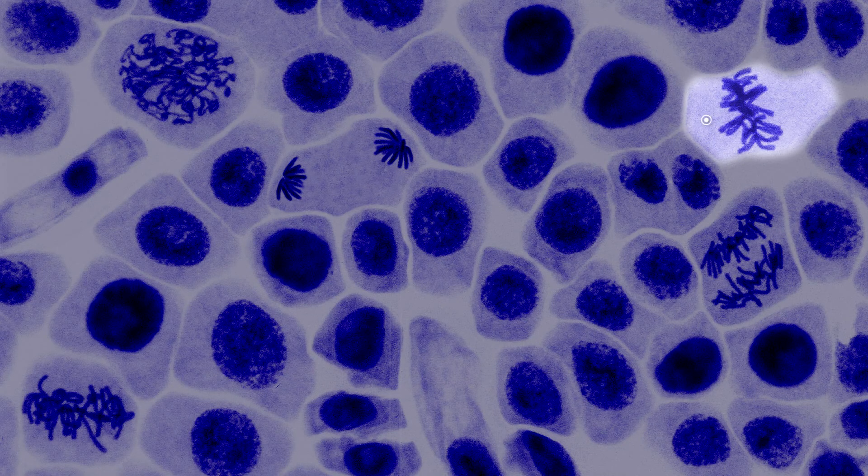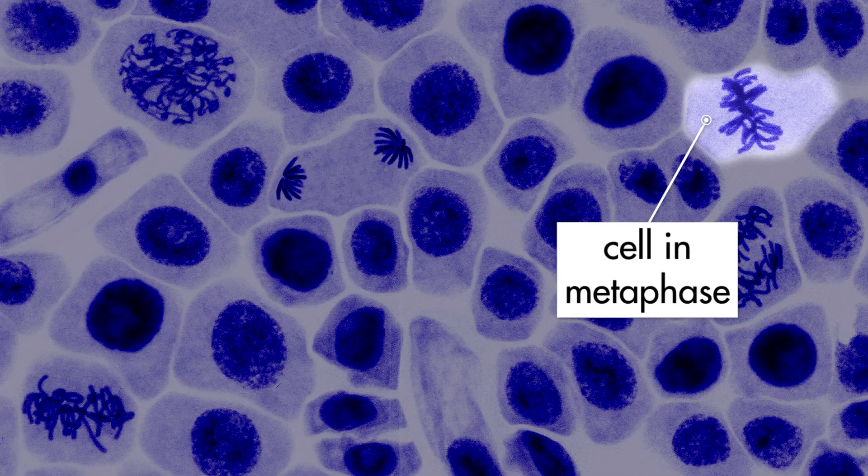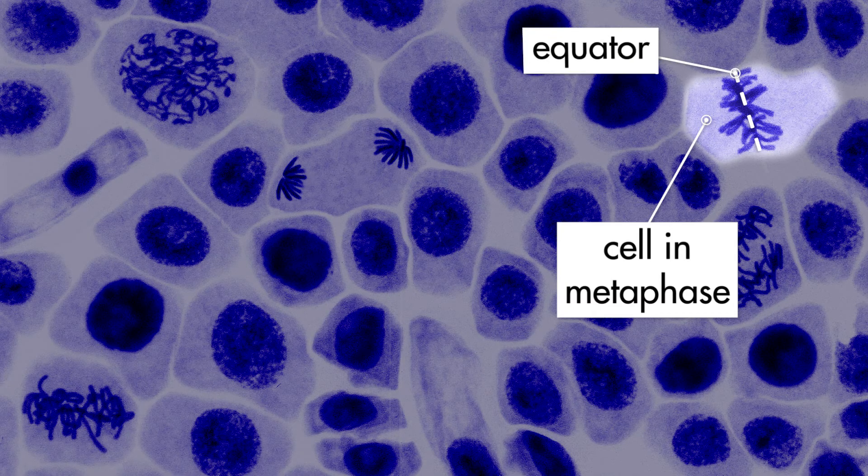The next phase of mitosis is called metaphase. During metaphase, the microtubules cause the replicated chromosomes to line up along the cell's equator.